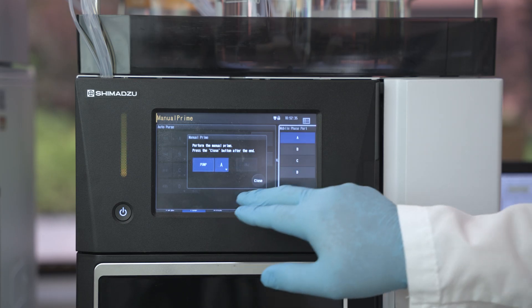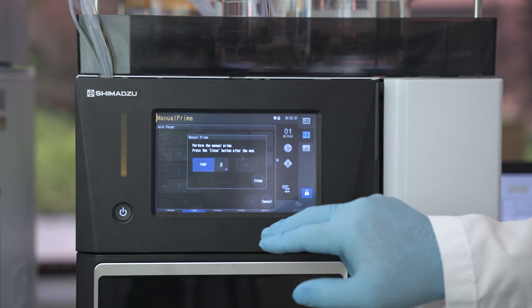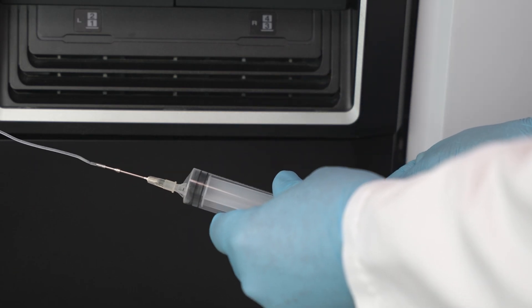Using the touchscreen, click on pump B. Collect 10 to 15 milliliters of mobile phase.